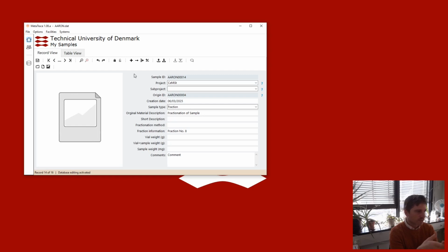Then someone downloads that strain to make a culture. From that culture, they extract. So this chain of these origins can become very, very long. So we don't want to be in a situation where we could delete an origin somewhere in the middle there by deleting a record and then lose this continuation of how we got from A to B, basically, or A to Z.